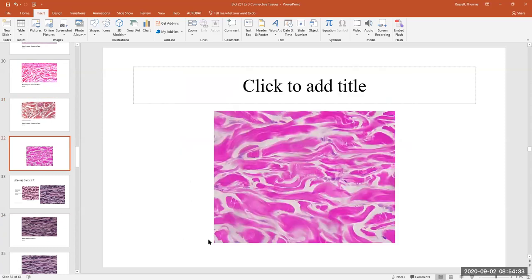Here's another diagram of dense irregular connective tissue showing the splattering effect of fibers running in different directions.